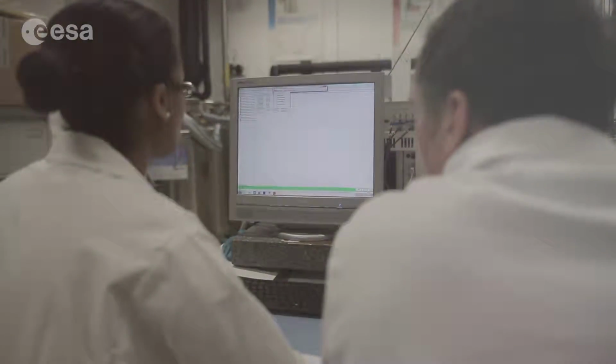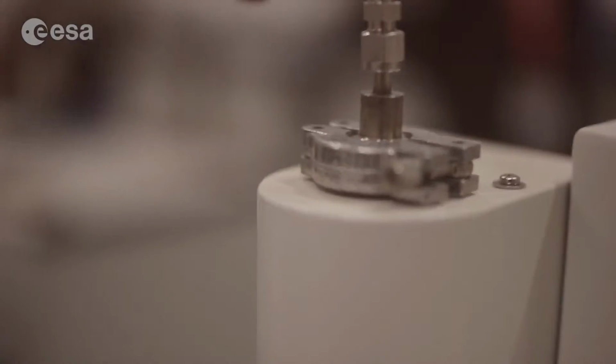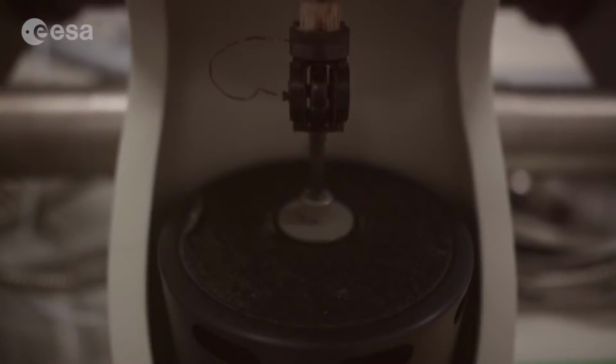And then we use that in a technical interpretation, in this particular case for something called time temperature superposition, which is where we can move these effects on the time axis because we've modified the temperature axis, and we can look at acceleration effects and start making some predictions on how a material will respond in a longer duration compared to what our experiment is.